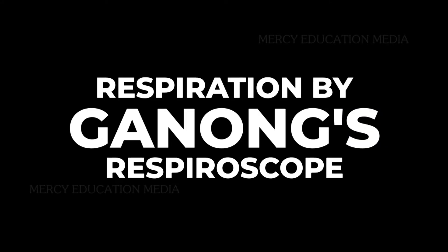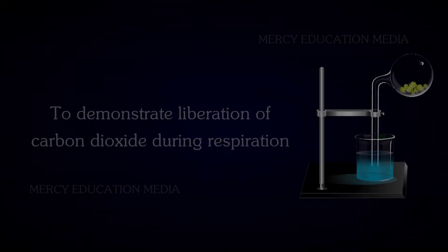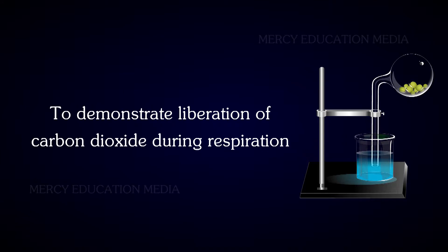Let us see the demonstration of respiration by Ganong's Respiroscope. The aim of this experiment is to demonstrate the liberation of carbon dioxide during respiration.